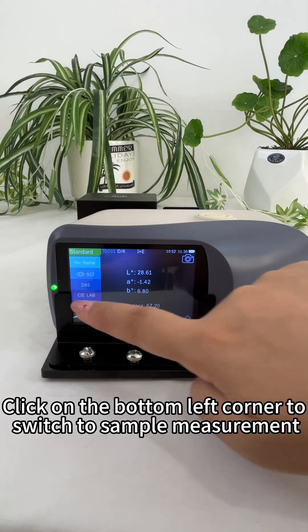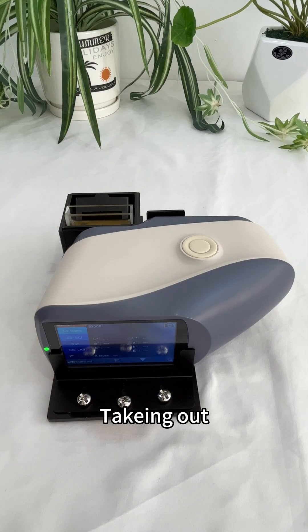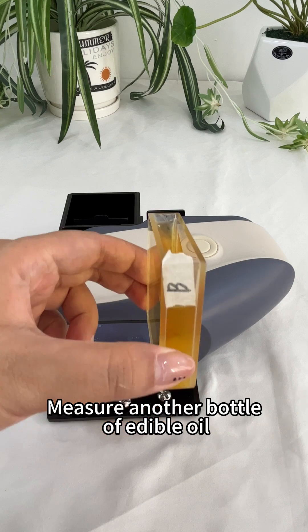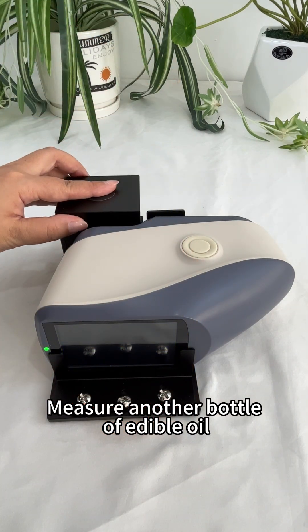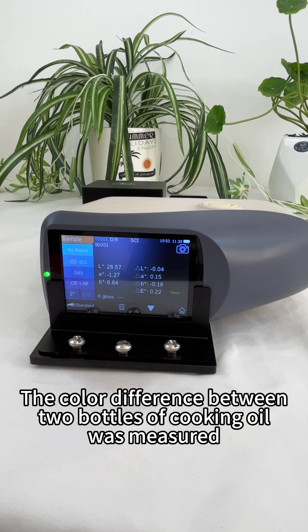Click on the bottom left corner to switch to sample measurement. Taking out the first sample, measure another bottle of edible oil. Press the measurement button. The color difference between the two bottles of cooking oil has been measured.